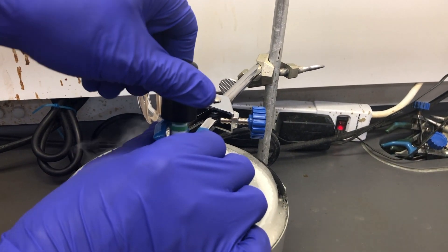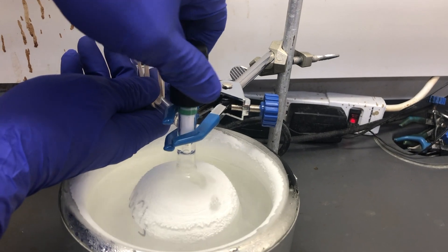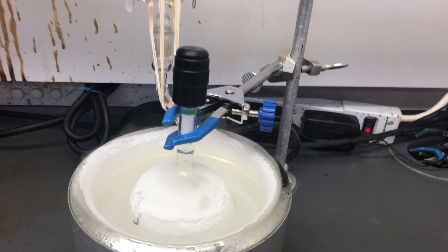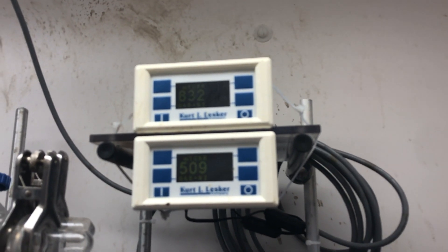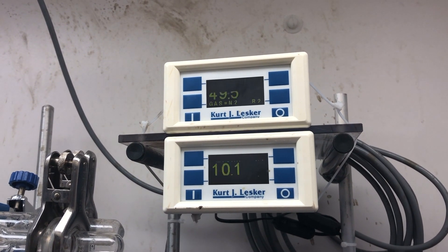Once you are sure there is no liquid left, gently begin to open the Teflon stopper and introduce a vacuum into the flask. This is step number two: pump. We have electronic vacuum gauges that we are using to monitor when the vacuum gets back down to its lowest point and all the air has been removed from the flask. Once that has been done, the Teflon stopper is closed again.